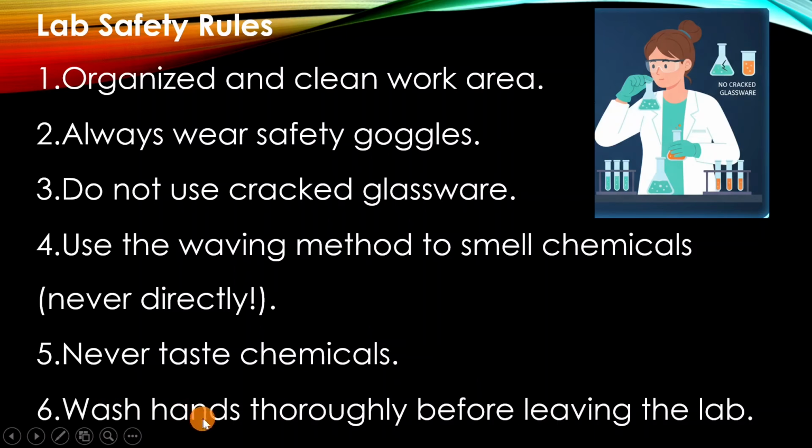Then, wash hands thoroughly before leaving the laboratory. Very important, because those chemicals in the laboratory might contaminate your hands. And then when you don't clean your hands, you might transfer them into your mouth as you touch food.